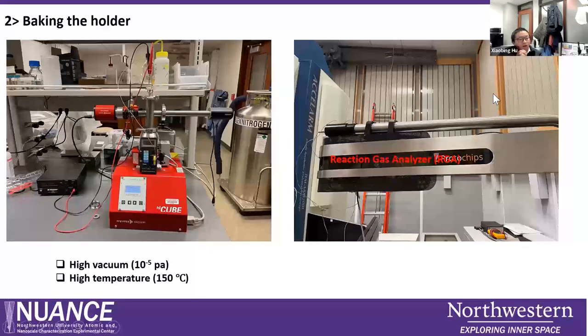So another one is the holder. As I mentioned to you, the holder may be contaminated. So what you can do is take your holder. But unfortunately, in the market, there is no pumping system which can be used to bake your holder at a high vacuum condition and also high temperature. There is no pump station like this.